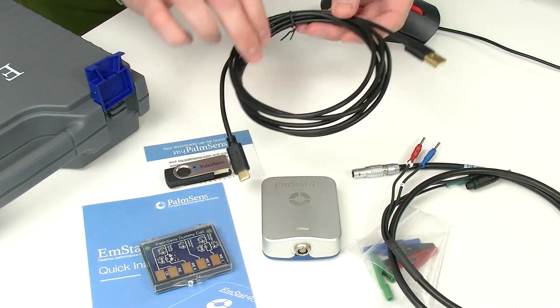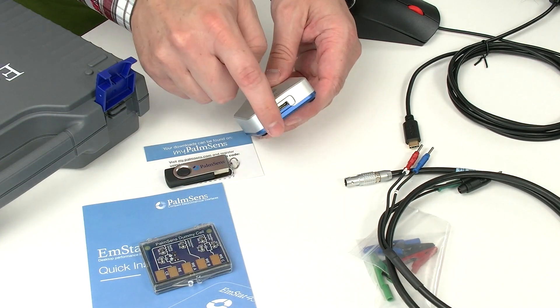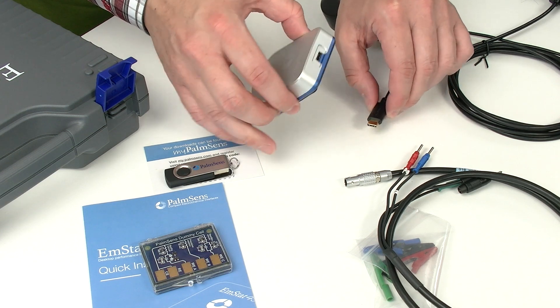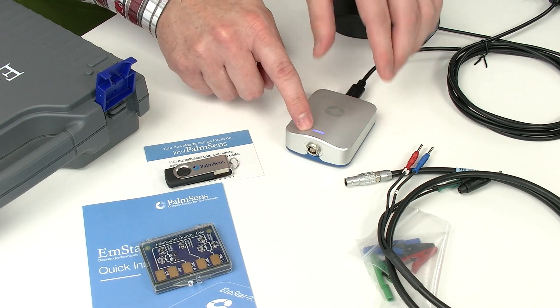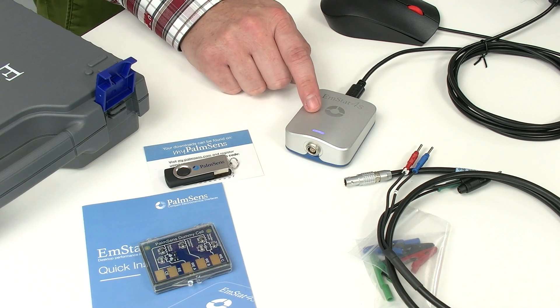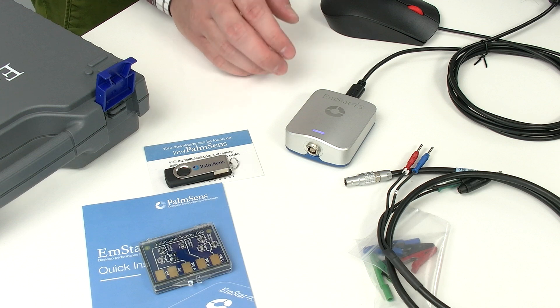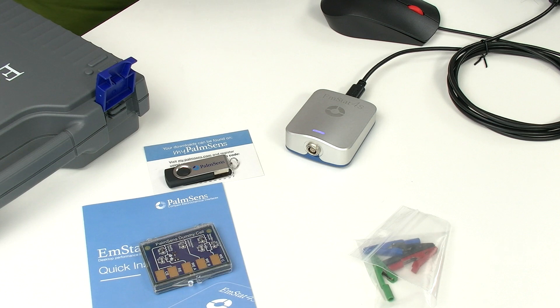Now we know what we get with our EmStat 4S, so we can perform our first measurement. First, I connect the USB cable to the computer I'm planning on using, then I connect the EmStat 4S USB port to the USB plug. You'll see a green blinking briefly — green means the instrument is booting — and then it turns blue, meaning it's ready to be used. But first, of course, we need to connect our cell — in this case, our dummy cell.